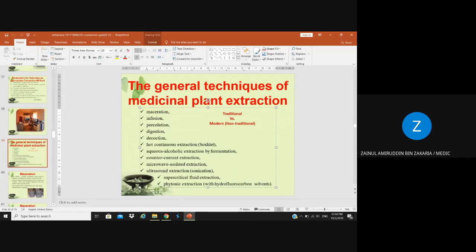So you put your extract in water, for example, or in solvent, ethanol maybe, and you put it in the microwave at a certain temperature to heat the extract, because it is known that the microwave effect can trigger the bioactive compound to change its structure and become more active compared to the normal condition, because of the heat effect on the bioactive compound.